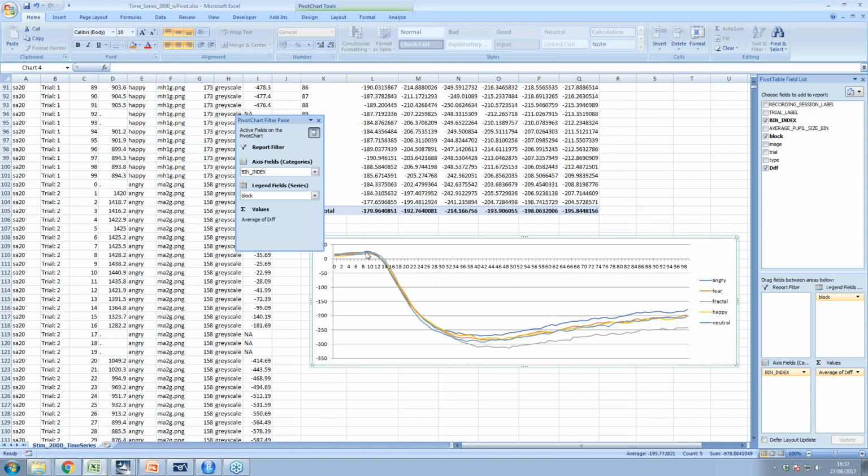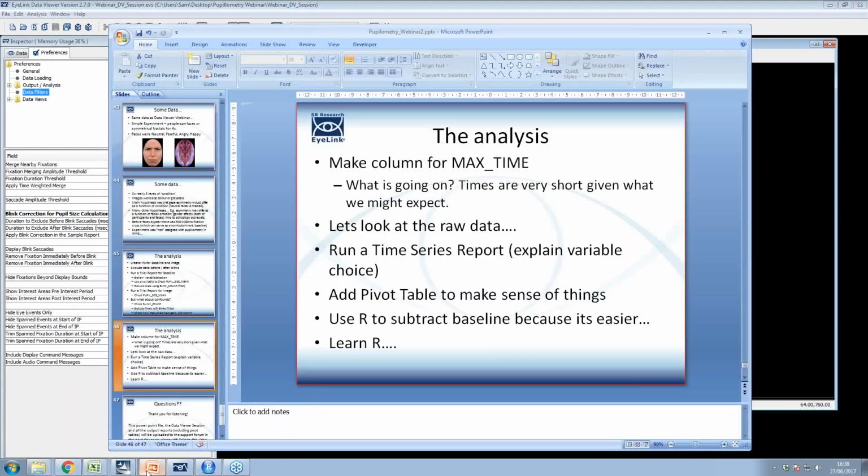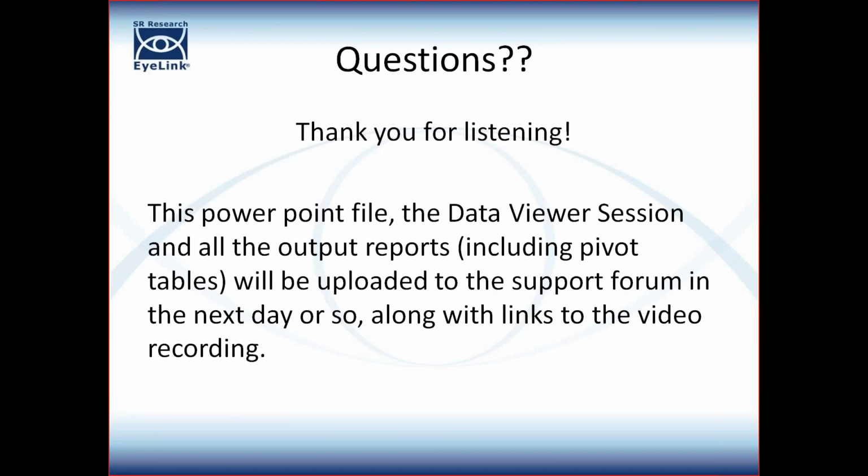Well, this is upside down because we're looking at the light response really to an image. But if this was a cognitive response, you could measure its slope, the time it takes from when it starts to when it reaches its maximum. All of these things may differ across conditions or manipulations. So at this point, I think that's about it as far as the analysis is concerned.